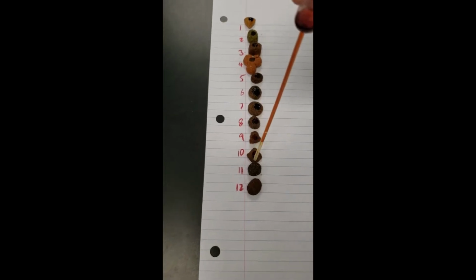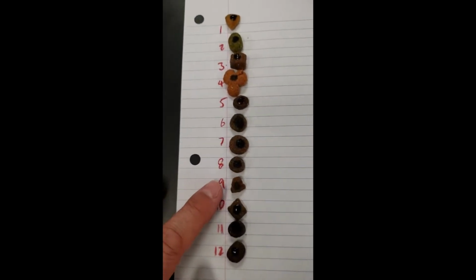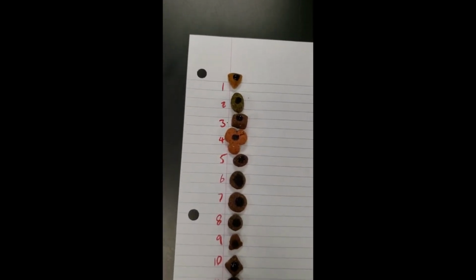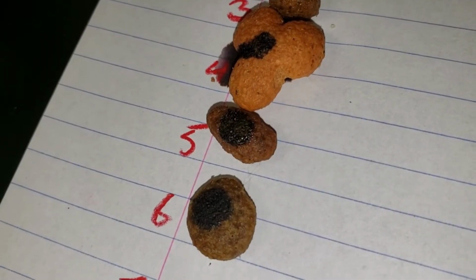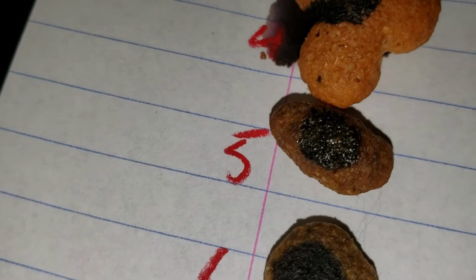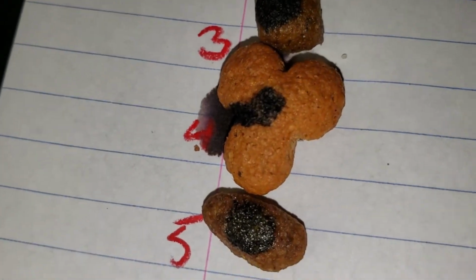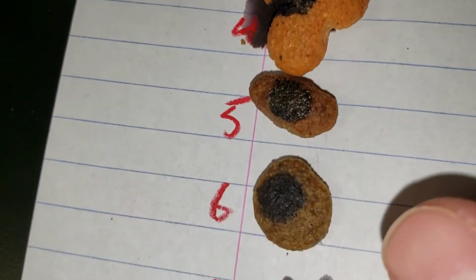This is iodine that we're putting on these to test for starch. What about this number? Number 9 doesn't look quite as... Still think brown, 5 is more brown colored, but it seems like the longer they sit, the darker they get. So this one does have a distinctly browner appearance than this one, which is more black.